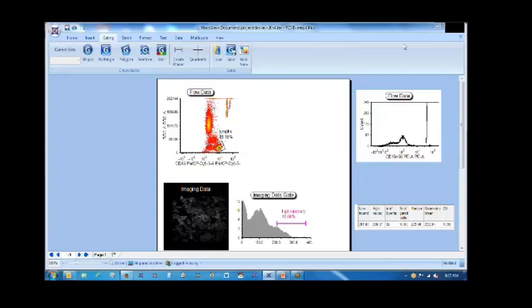It's not a fancy analysis, but I chose a simple layout on purpose because I just want to show you that this is an example of looking at flow data and imaging data side by side. Over here we have a typical density plot for flow data, and down here we have, this actually didn't come off of an image cytometer, it just came off of a regular microscope, and then the results were segmented, i.e. you have object recognition, each cell is an object.